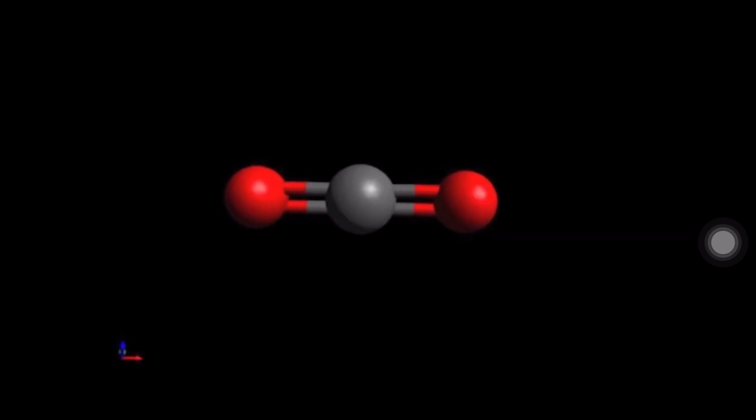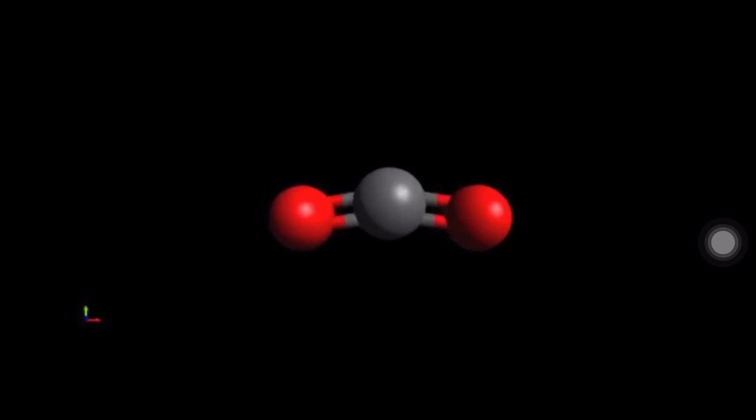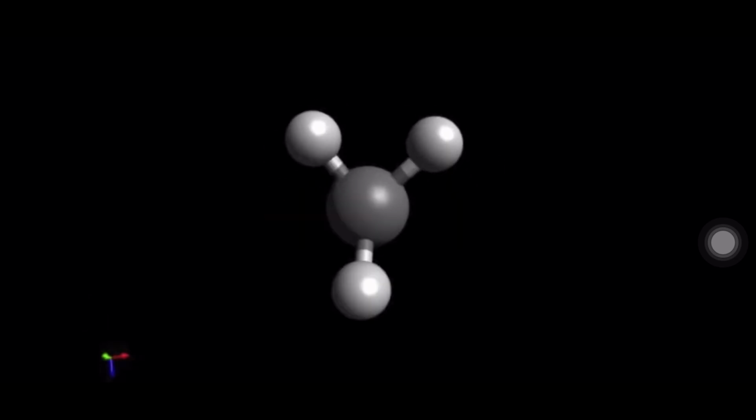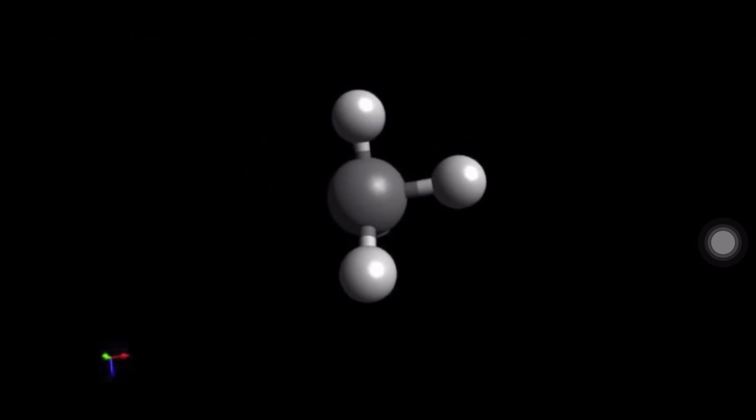This model shows the symmetric stretch in carbon dioxide. This is the asymmetric stretch in carbon dioxide, the bend in carbon dioxide, scissoring in methane, and rocking in methane.